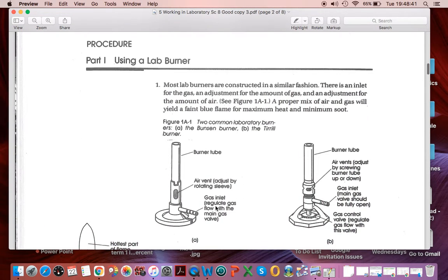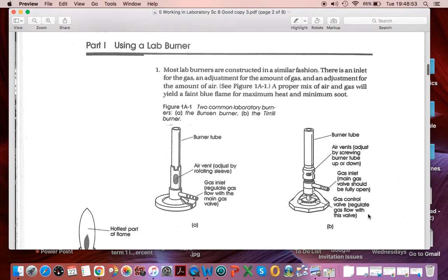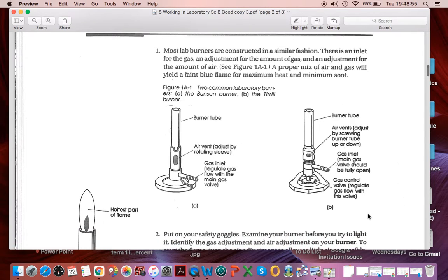So for the first part, we're going to be using a lab burner, and one of the things you're going to have to do is sketch it. Although we have both types of lab burners, B is the one you're going to want to sketch, because that's the one we use in the classroom. So we have to get to know how to use a lab burner, and also different parts of it.